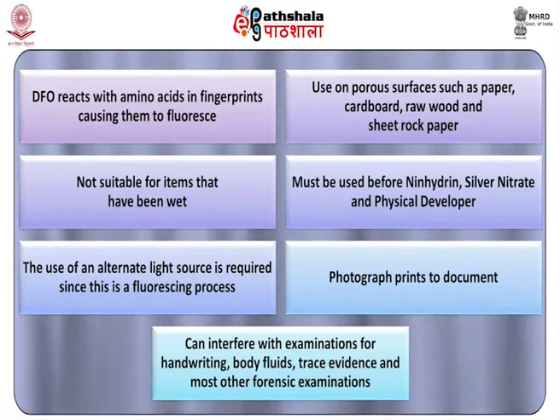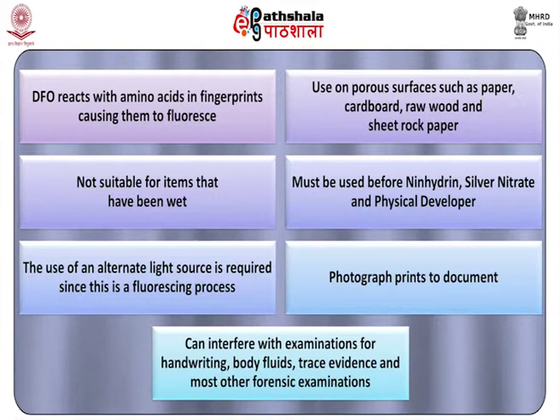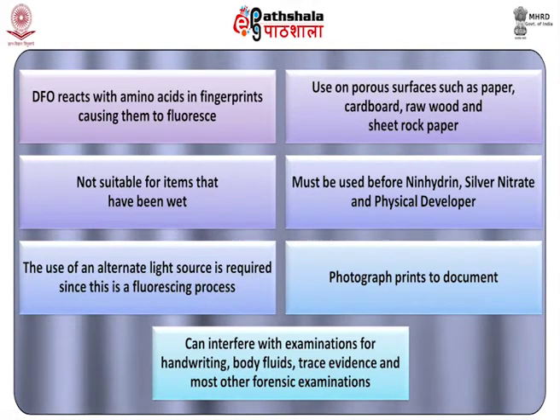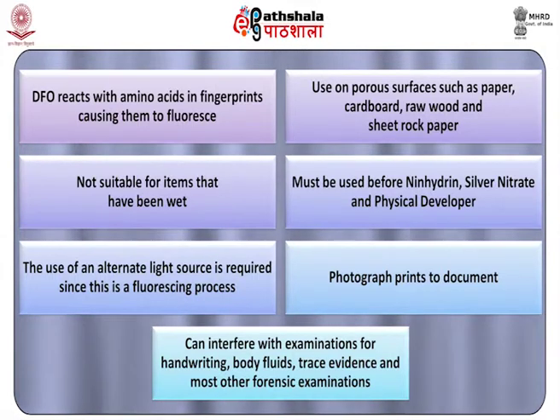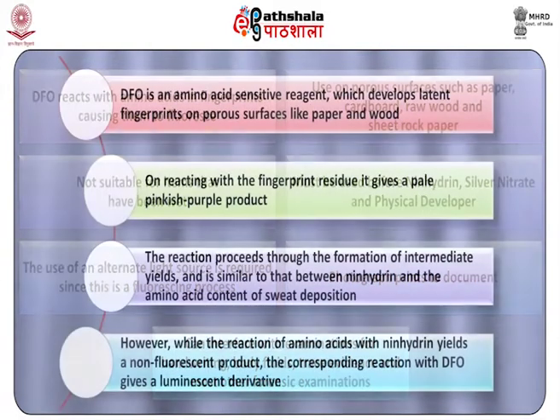The use of an alternate light source is required since this is a fluorescing process. Photograph prints to document, as DFO can interfere with examinations of handwriting, body fluid trace evidence, and most other forensic examinations.